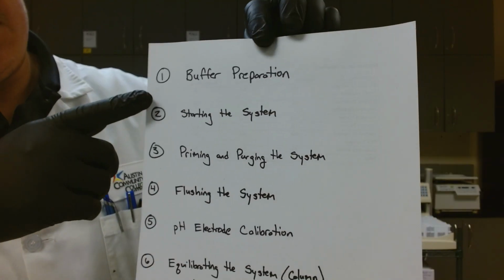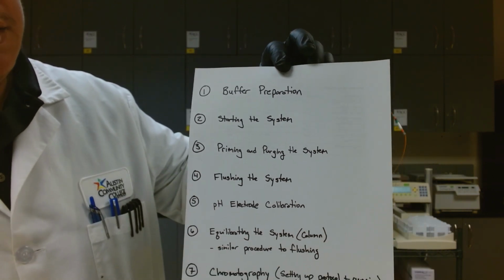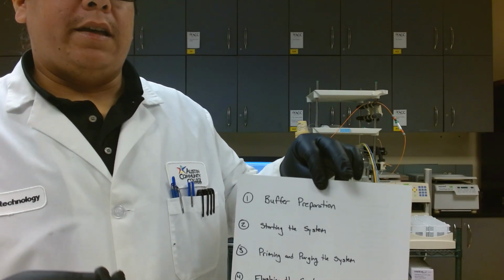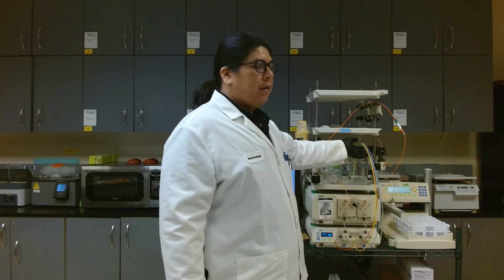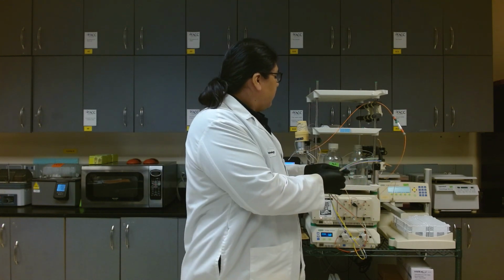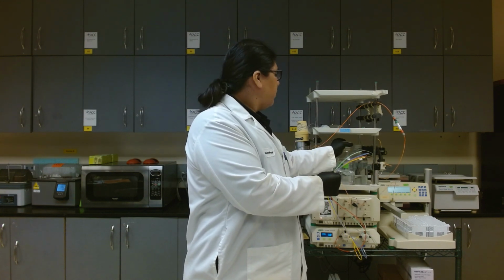All right, so now that our system has been started, next thing we'll do is show you how to prime and purge the system. So when we're priming, what we're doing is we're drawing in the new buffer into the inlet lines. All right, so the first thing I'm going to do is take the tubing out of the ethanol, and I'm going to put it into our filtered and degassed water.